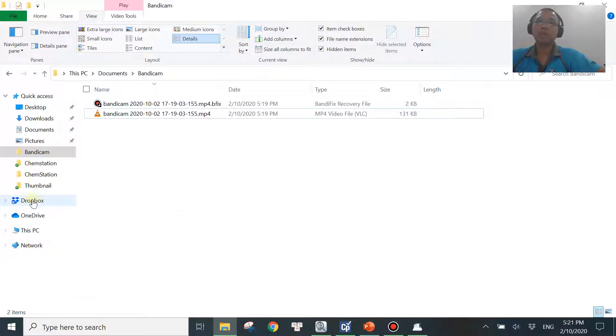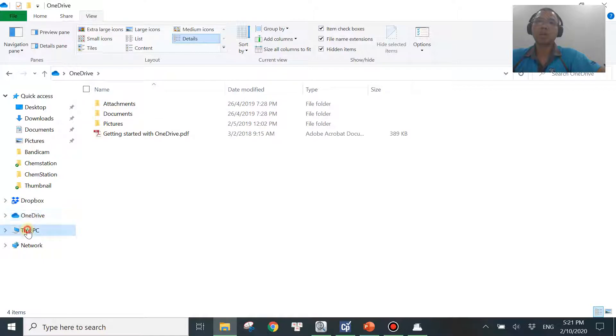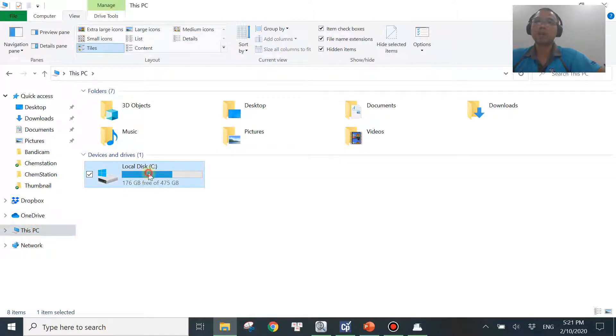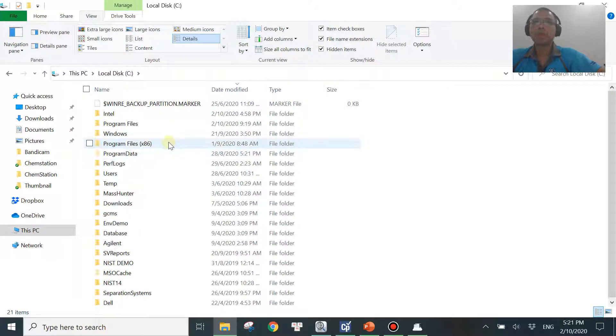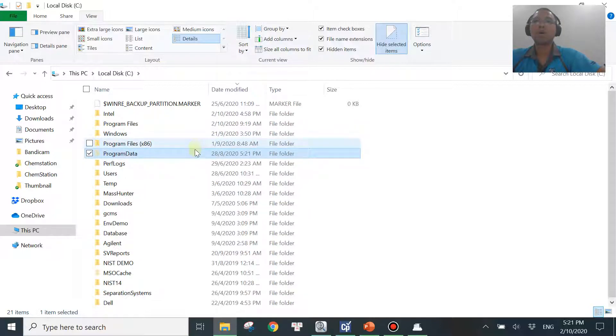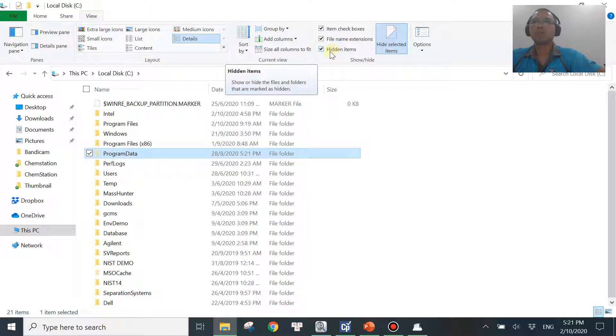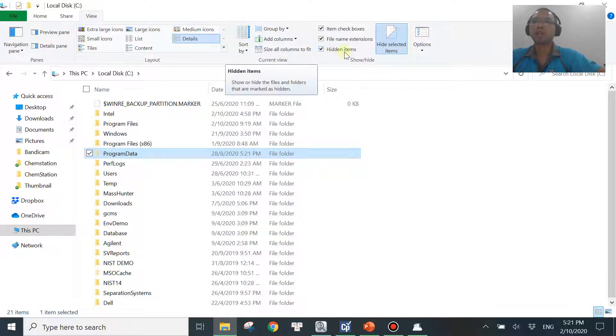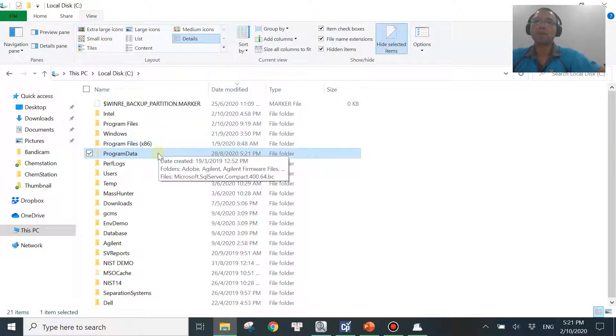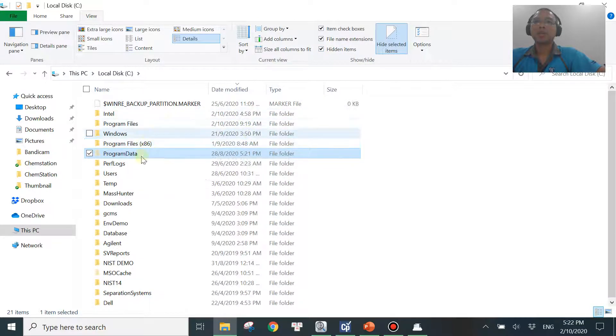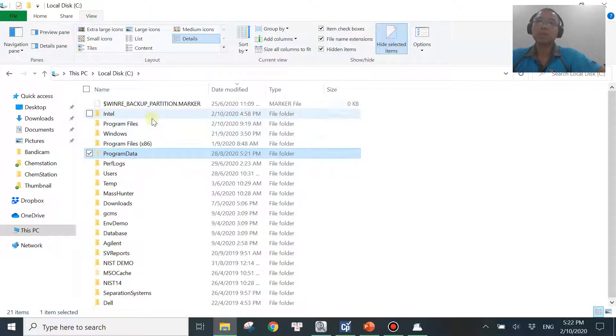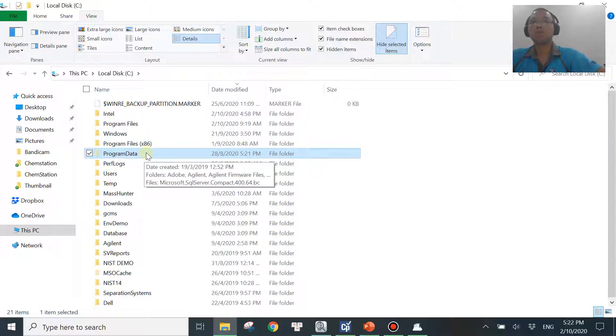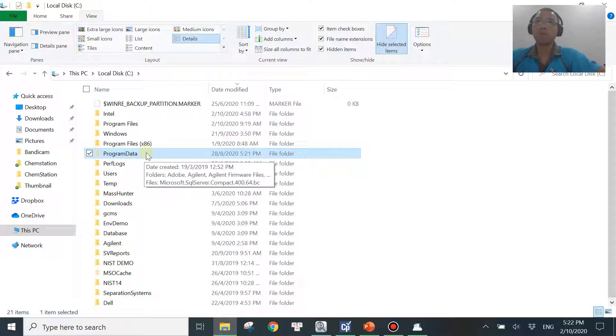First, you need to go into your C drive. Then you get into program data. And in order to see program data, some of the OS, you need to enable the hidden items over here. You go to Views and check the hidden items over here in order to see program data. But because right now I'm using my version, the version I'm using is quite new, C01.10, which is the latest version.